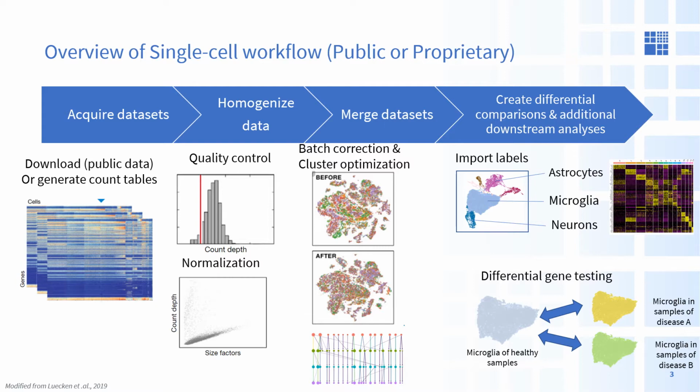Now, all of these steps can be performed using a bunch of different available pipelines, but the most commonly used two are ScanPy, which is Python-based, and Seurat, which is R-based. Since Seurat is very user-friendly and there's a lot of visualization tools available in Seurat that need to be handwritten for some of ScanPy, this video today is going to focus mostly on Seurat.